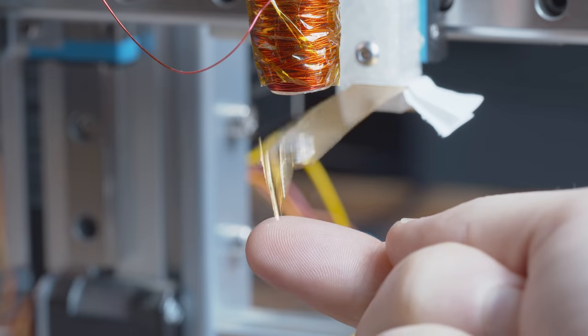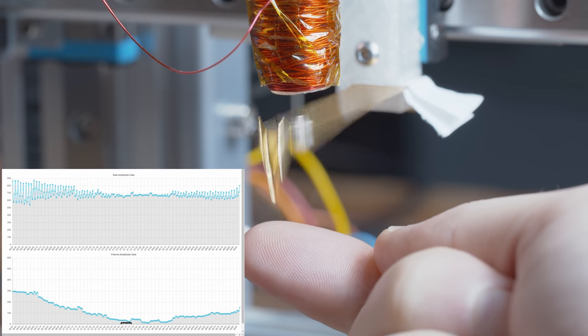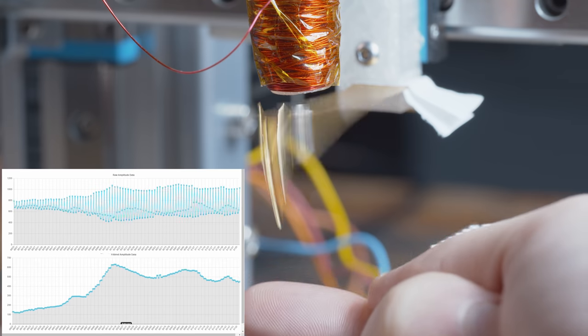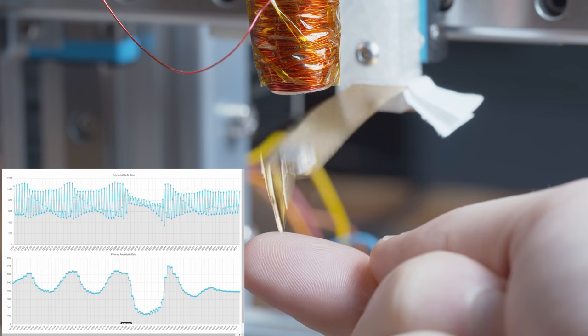The way a tapping mode AFM works is it senses the displacement of the cantilever and uses the amplitude of the oscillations to determine when it's in contact with the surface. You can put something in the way of the cantilever — my finger here is now impacting it and the amplitude has changed. A tapping mode AFM monitors this amplitude and tries to get back to a predefined set point. If the amplitude is too small it moves up — meaning you're too close to the surface — and if the amplitude gets too large it moves down. This up-and-down movement is how it tracks the height of the sample under test.